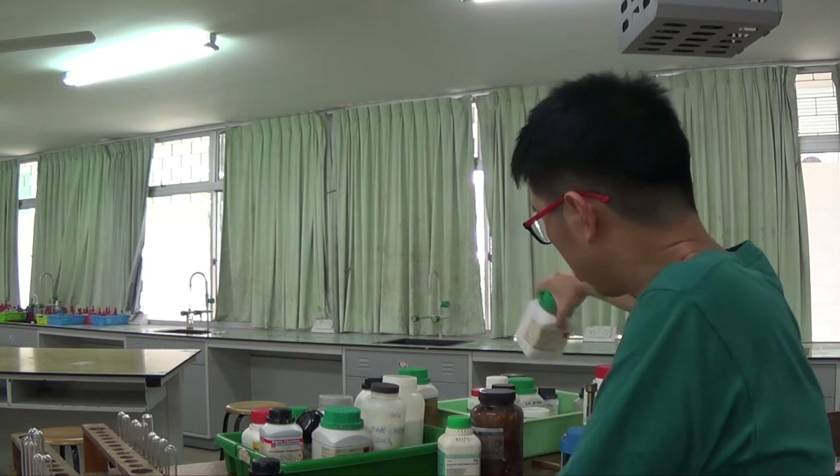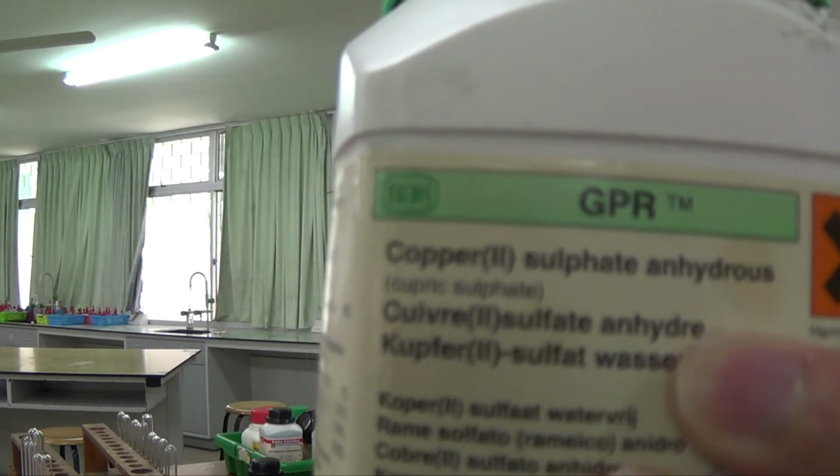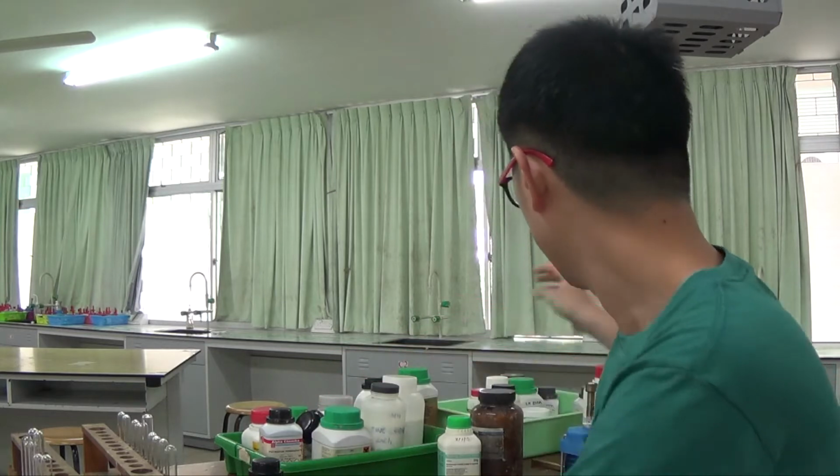There's some copper 2 as well. So this is copper 2 sulfate anhydrous. It's a bit whitish because you're removing the water of crystallization.